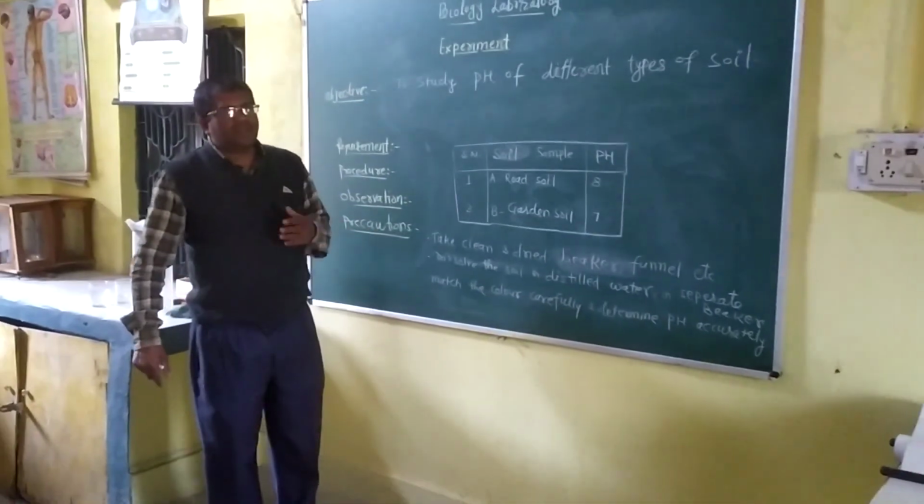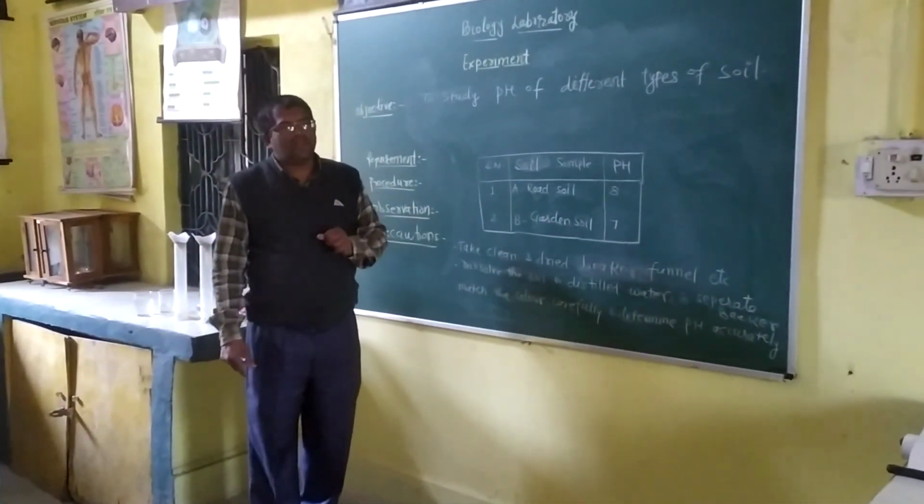So thus we have determined the pH of the road soil as well as garden soil.